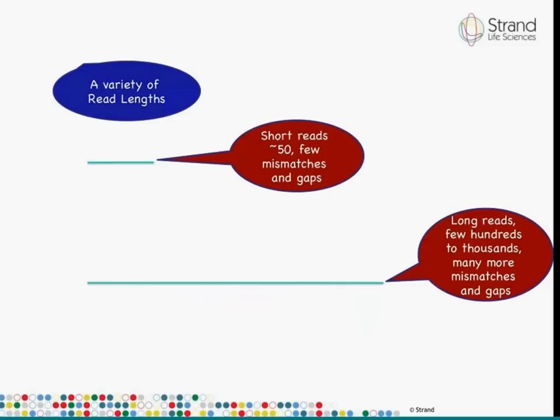The third consideration is handling a variety of read lengths. A few years ago, next-generation sequencing was restricted to read lengths of about 30 bases, but now the minimum is around 50 and the maximum can go up to a few hundred to a thousand. For short reads of about length 50, you want only a few mismatches and gaps; as reads get longer, you need to handle many more. The earliest aligner Bowtie does not handle gaps. BWA works best with few gaps but slows down with longer reads, which is why BWA-SW was introduced. Any aligner must be able to handle a variety of read lengths.